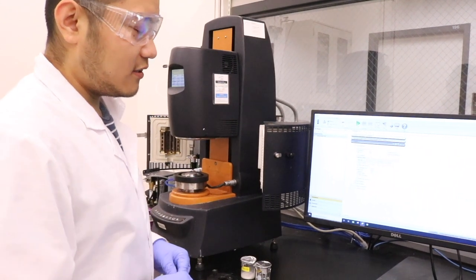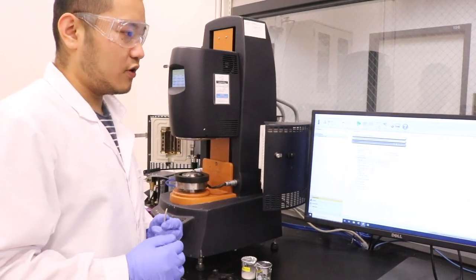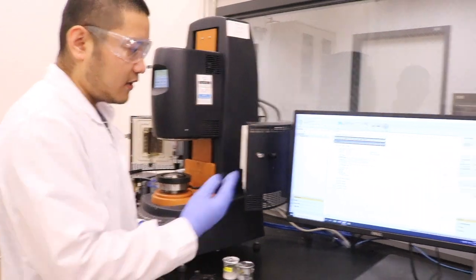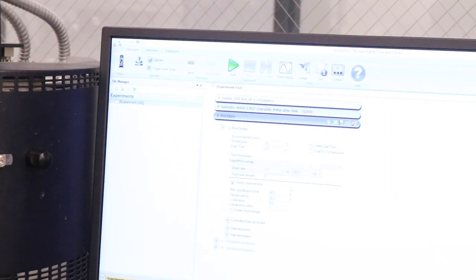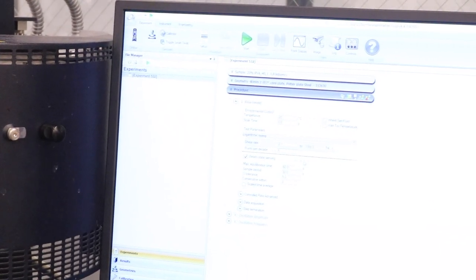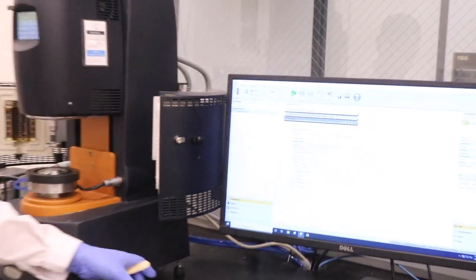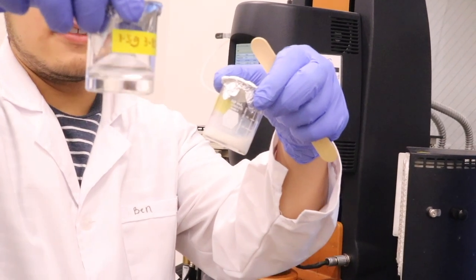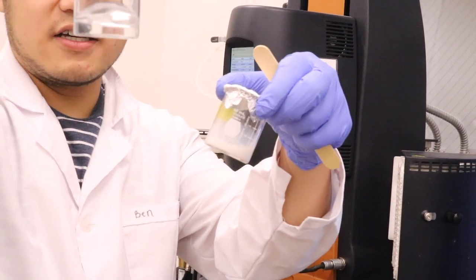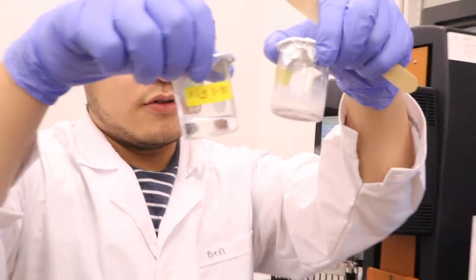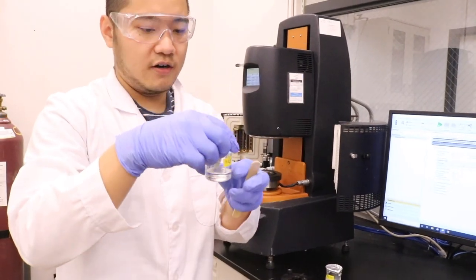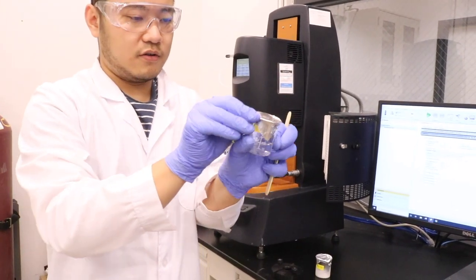So to run the rheology test, the first thing is to program your experimental steps on the provided software. We will need to set up the shear rate and the temperature and points per decade. Today I have two different types of samples with different viscosity. As you can see, this one has a liquid-like property while this one has a more solid flow ability. So we will test both and compare their rheological behavior.